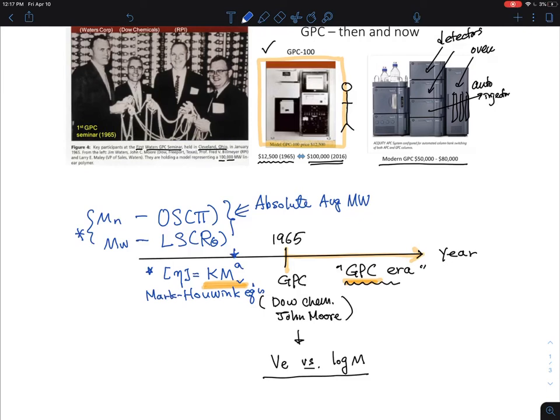The anionic polymerization was reported, and so now people have a collection of samples with a well-defined molecular weight. Using this reference synthetic polymer that has been made into a monodispersed polymer, they use it as a calibration standard to make this GPC characterization easier to be done. So GPC, once again, is a relative method.